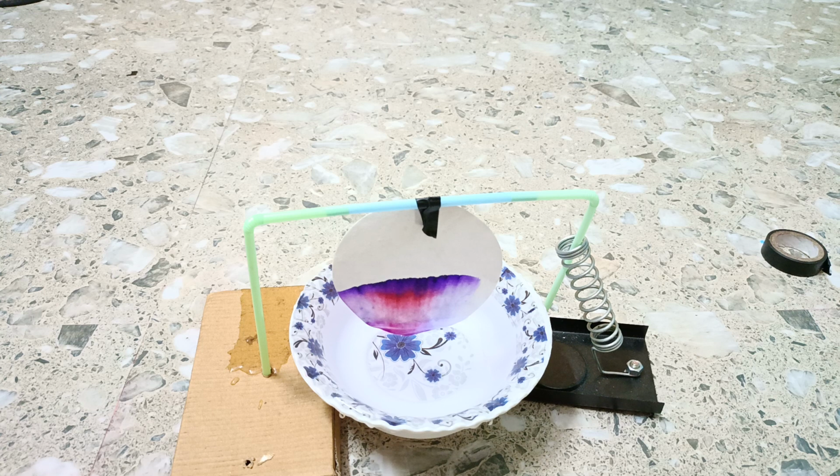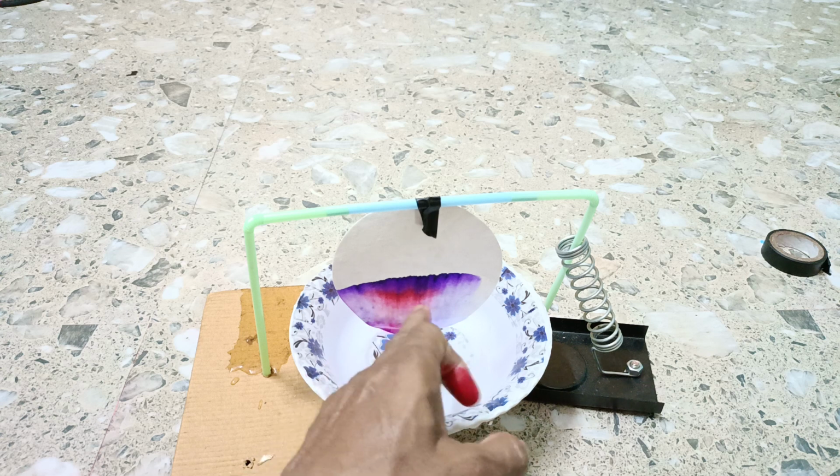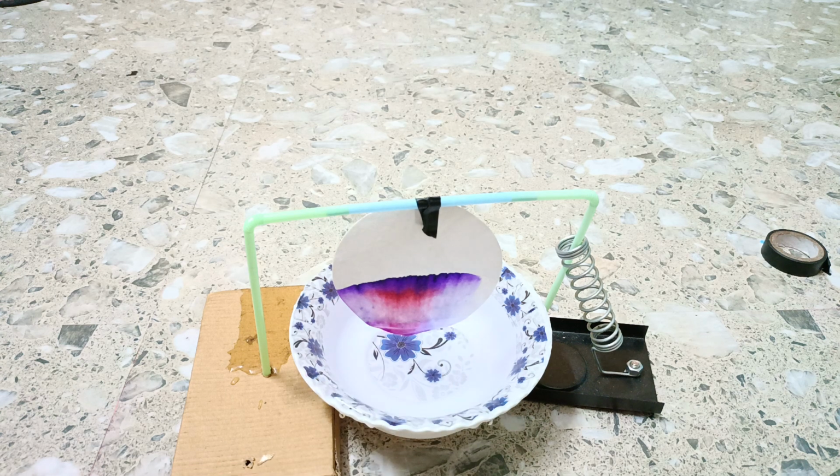And here we have taken filter paper, or you can also use chromatography paper. But here we have used the filter paper, and it acts the same as the chromatography paper. Right? You see here how the color is differentiating between the two. One is red color and the other is blue. Here you see this is the red color patch, and this is the blue color patch. In this way, we can separate the blue color and red ink separately by the method of paper chromatography. This is what we call paper chromatography.